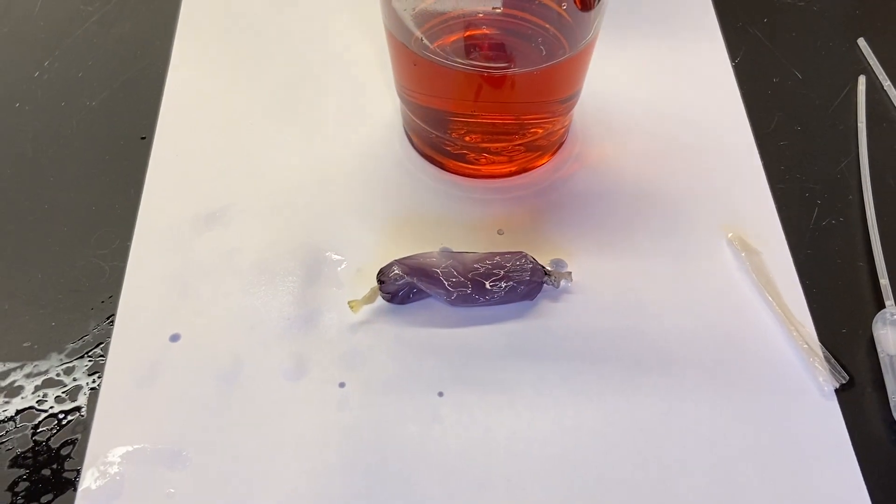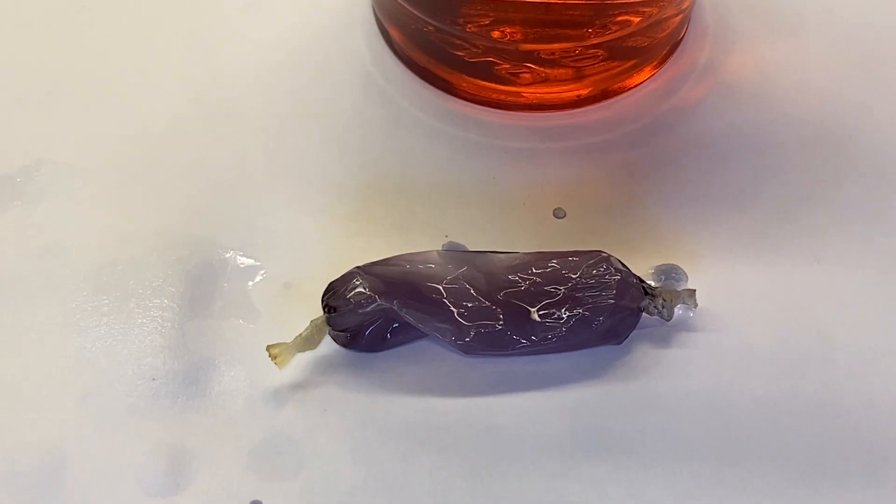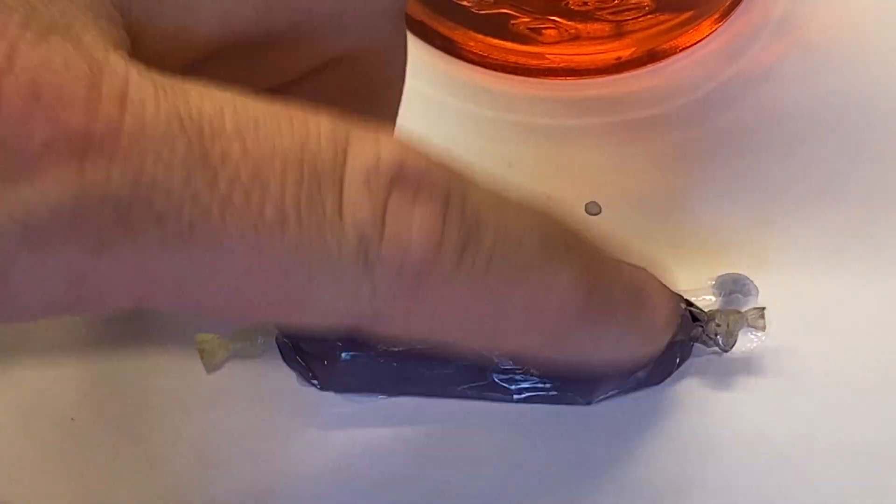Let me zoom in on it so we can see it a little bit easier. There's still the same amount of fluid in here.